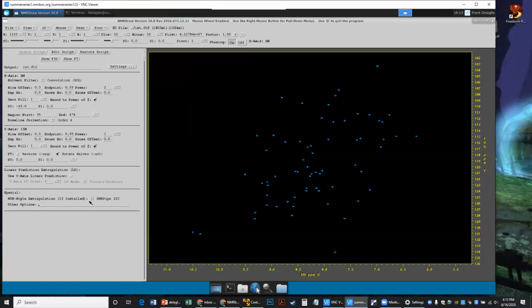The reason it came up was the slide you showed about the nonlinearity, and I was pointing out that not all IST algorithms have the same nonlinearity. Right. In fact, the ones that tightly constrain or exactly force the mock data to match the measured data would be the ones that are most highly linear. So the result that you saw is from the other approach.